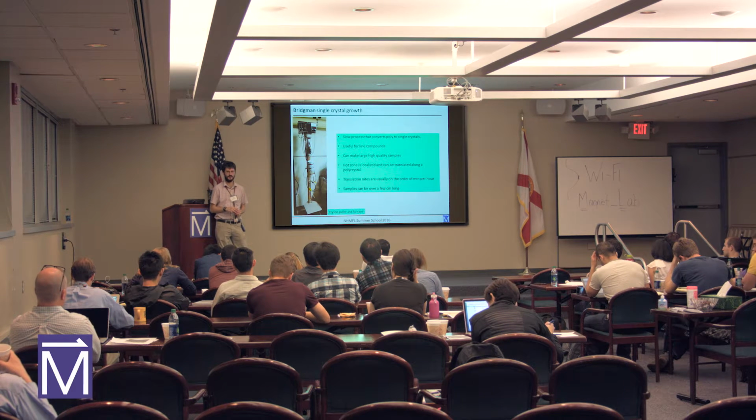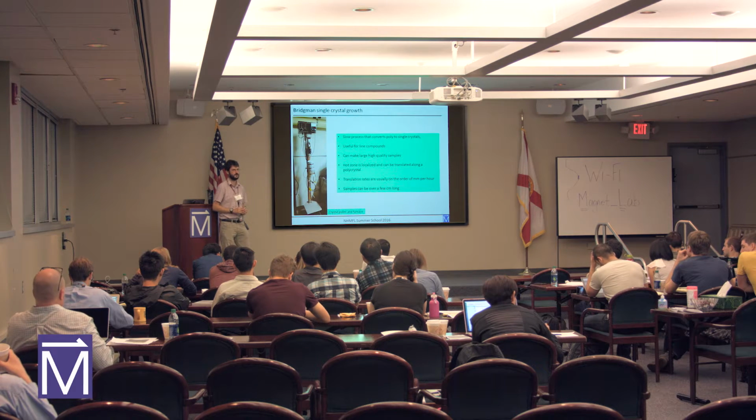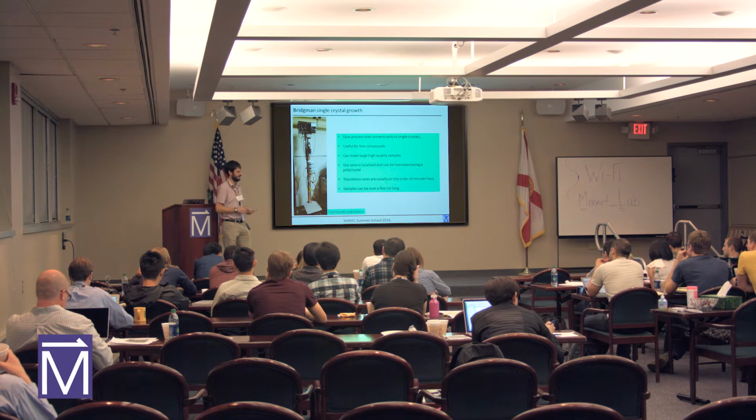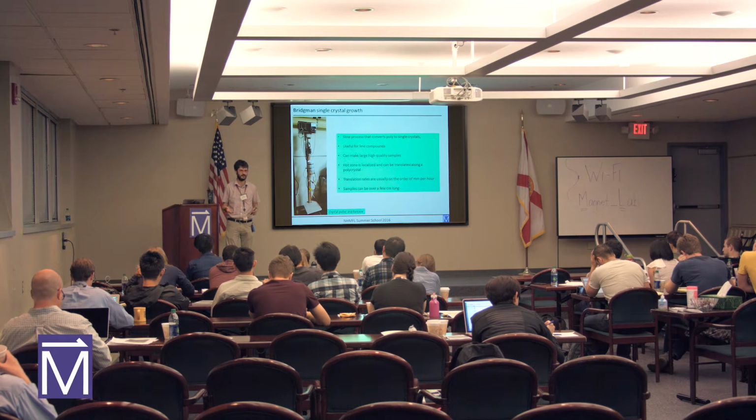Maybe. Well, first advantage is that this is cheap, okay? They've been doing this since the 1940s or 30s, probably. I would also say, so I'll come to the image furnace in a few slides, I would also say that the image furnace is particularly well suited for insulators. This might be more flexible. Doing intermetallics in an image furnace is really quite challenging. So, okay, other questions? Okay.